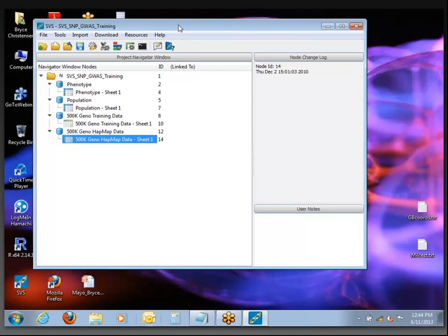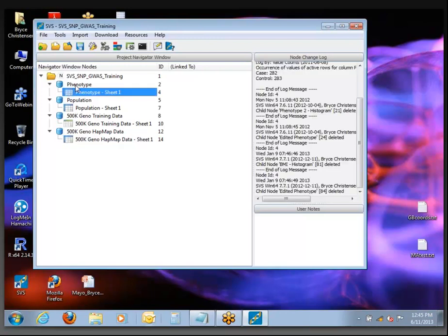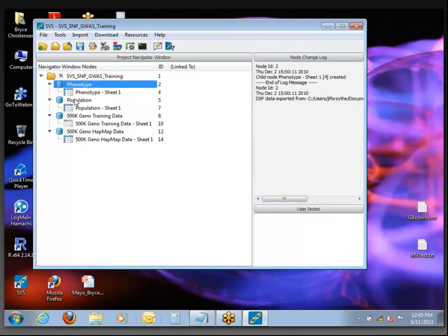What we're going to do is follow along roughly according to this document — we may skip a few steps and add in a few others as we go along. Right now we are somewhere on Part 1B, Opening Project. When you open the project, you should see a screen with four visible nodes. When a data set is first imported, it appears as a top-level node in what we call the Project Navigator, and each function that we run will produce some kind of output that will appear as a child node.